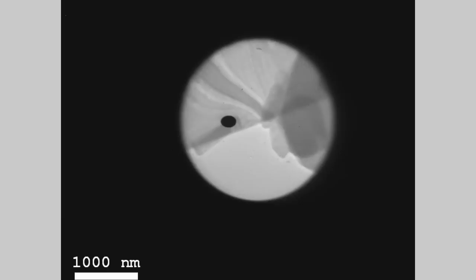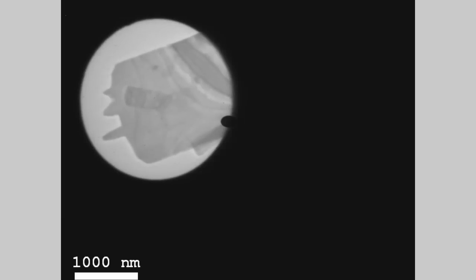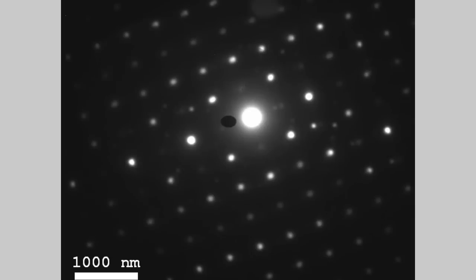If we want to make electron diffraction out of this, then we use the selected area aperture. And then we select the region of interest. Go to diffraction mode. And you see the diffraction pattern. And molybdenum trioxide is almost simple cubic in its structure. So we suspect to see some kind of square shaped pattern. As we can see in this image.